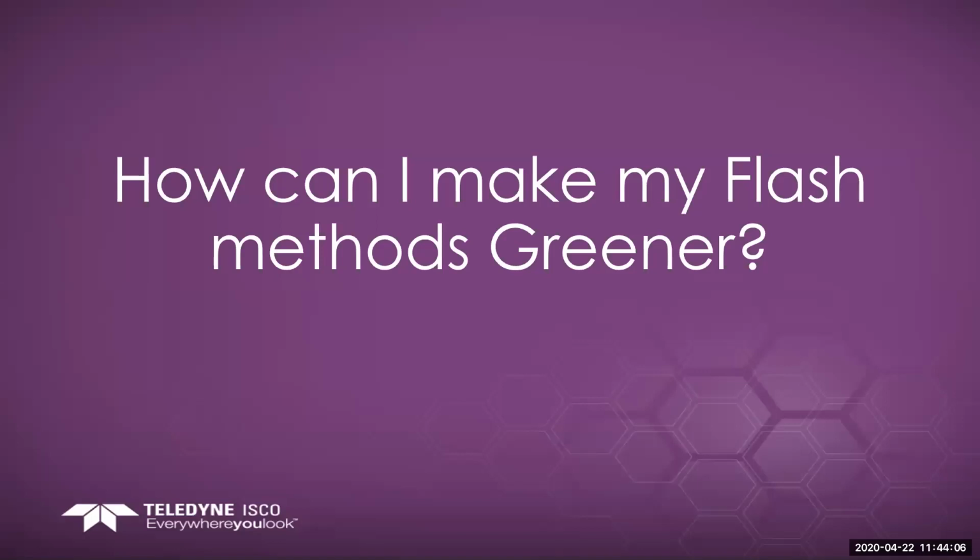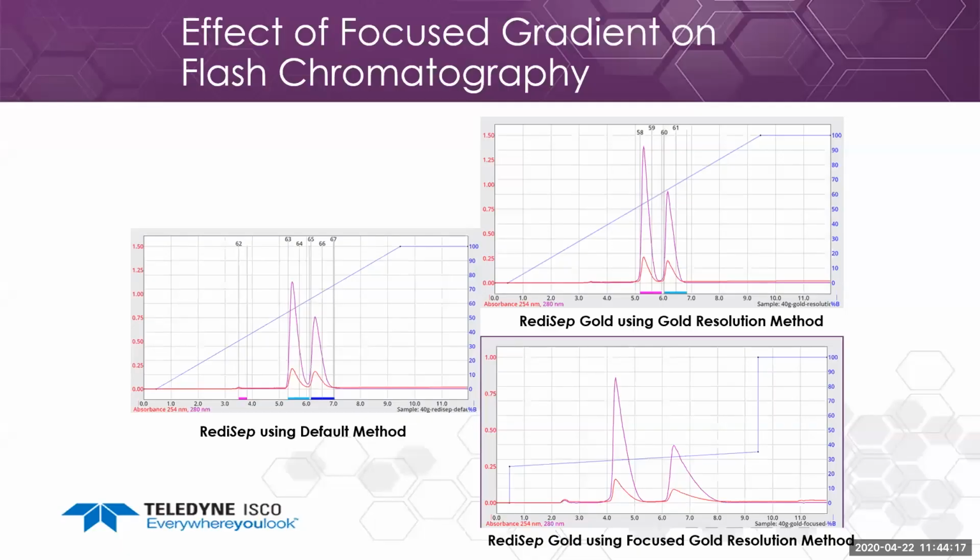So what about my flash methods? This focus gradient seems great on prep. It's easy to implement. How can we do this on our flash system? So this is something we're trying to implement on our flash systems in the future, something we work on in the lab.